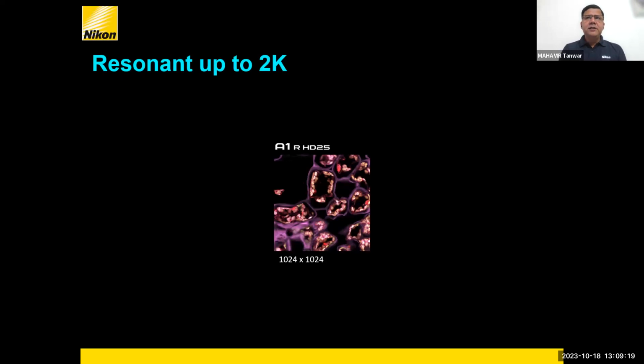For fast imaging, you need some kind of a fast scanner. So the systems are coming with a hybrid scanning technology. We call a high-speed scanner a resonance scanner, and we call a high-resolution scanner a galvo scanner. Resonance scanners are capable of capturing fast imaging and dynamic experimentation at a much faster rate compared to a galvo scanner. Galvo scanners are for high resolution. Resonance scanners are for high speed. But definitely, when the speed goes up, the resolution goes down and the image quality may go down. And if the resolution is high, the speed is low.